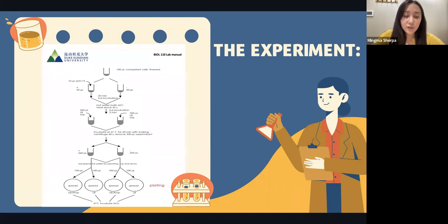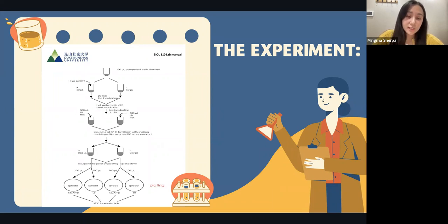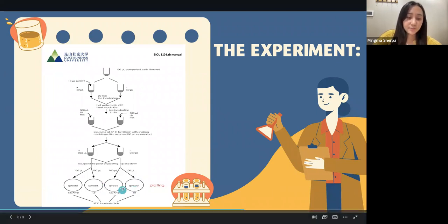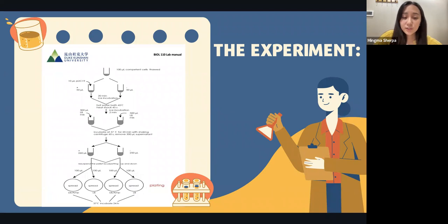We then place the tubes in a 42-degree hot water bath to provide heat shock for 45 seconds, and then place them into ice and incubate for two minutes. Then we add the LB mix — the liquid growing medium — to each tube. We incubate the tubes at 37 degrees for 20 minutes with shaking, then centrifuge for 60 seconds. We remove the supernatant, leaving two tubes — one containing the plasmid and one that does not. These cell suspensions are then spread onto plates, with one plate containing ampicillin medium. We look at observations to confirm whether the plasmid provided ampicillin survival ability, and also look for blue pigment to check if the lacZ gene is being transcribed.